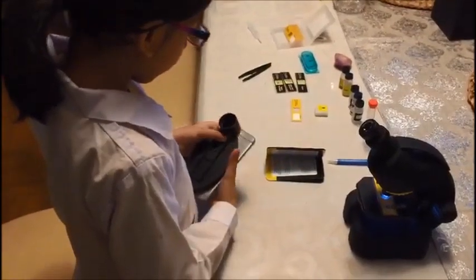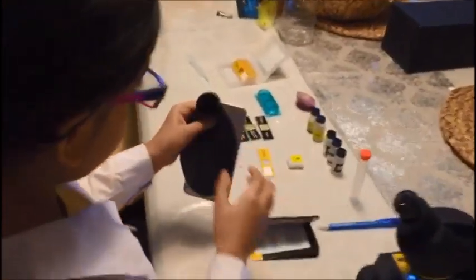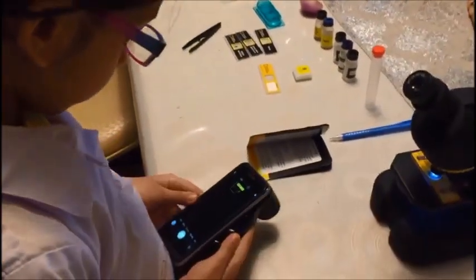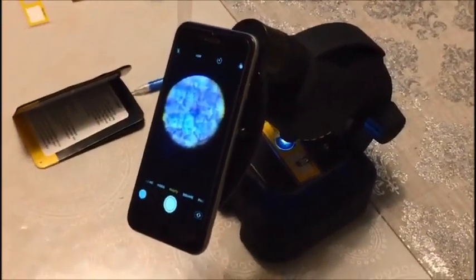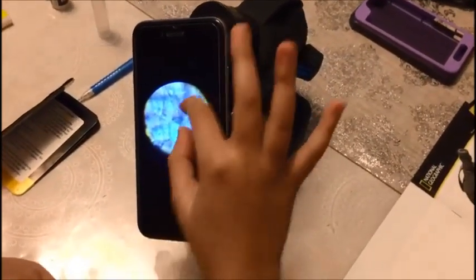So now I am going to turn it over. What you do is connect the camera with the hole. So now I have attached this. Just to let you know, you have to set it to photo mode over here. And then just take the photo. And this is how it turned out.